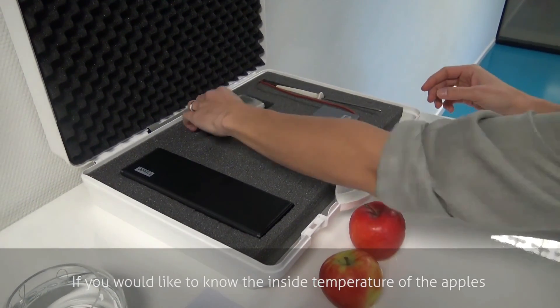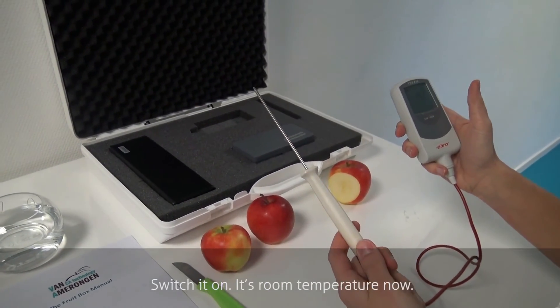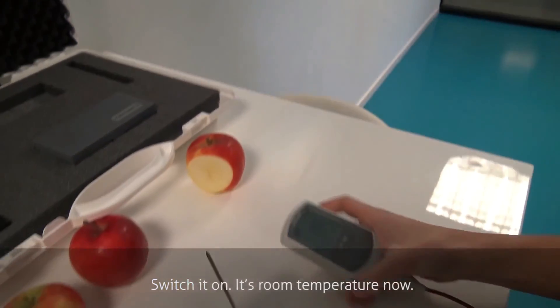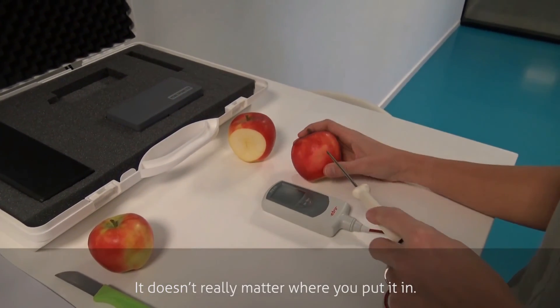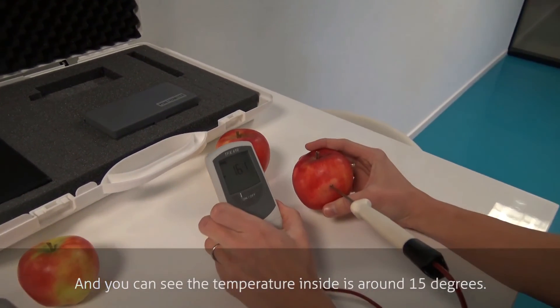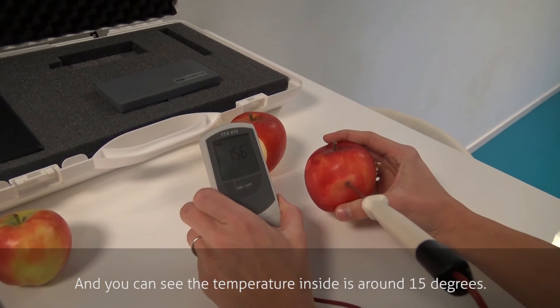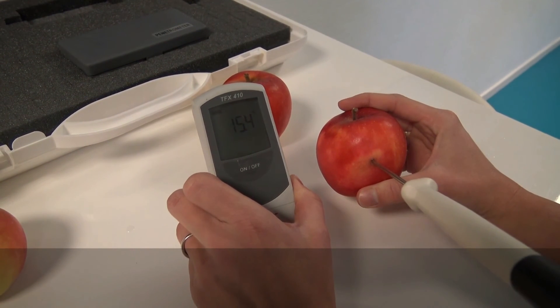If you would like to know the inside temperature of the apples, we take this device — a temperature meter. Switch it on. It's room temperature now. Now we take an apple. It doesn't really matter where you put it in. Put it into the core of the apple and you can see the temperature. Inside is around 15 degrees.